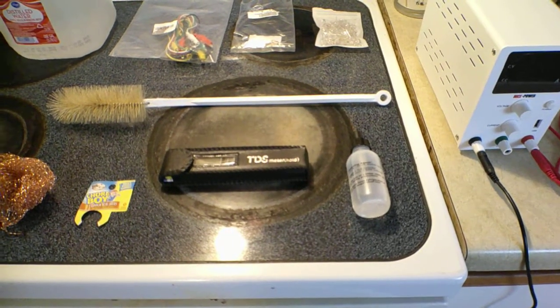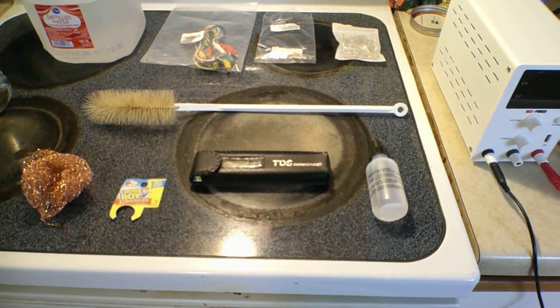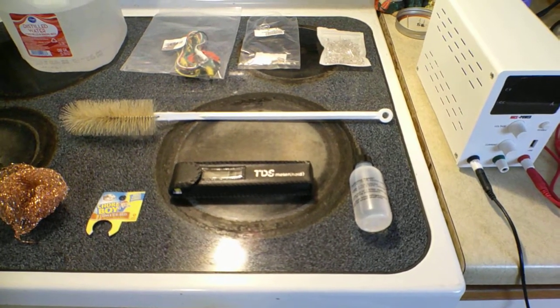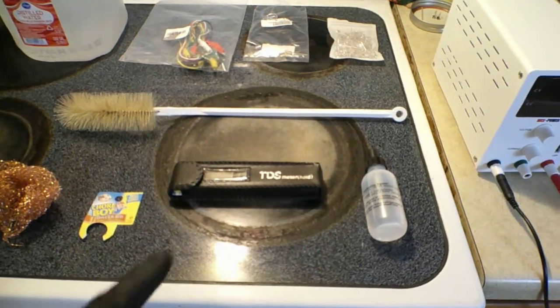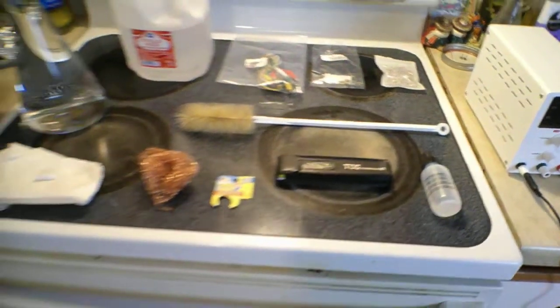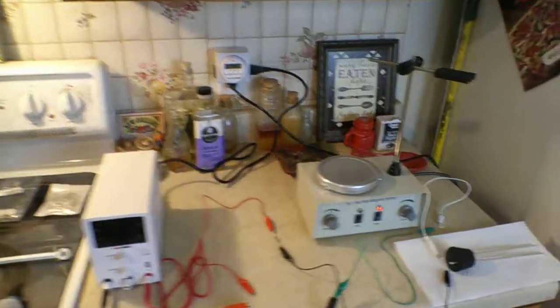At the end, the reagent will turn the ionic silver into true colloidal silver. True colloidal silver is yellow, not clear. The TDS meter will be able to measure approximately how strong our solution is once it's all finished.